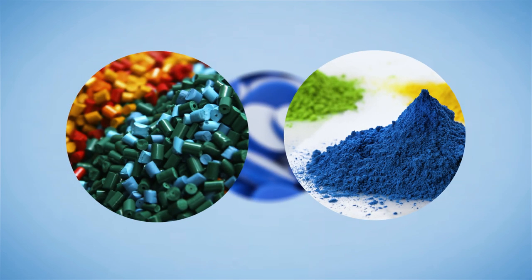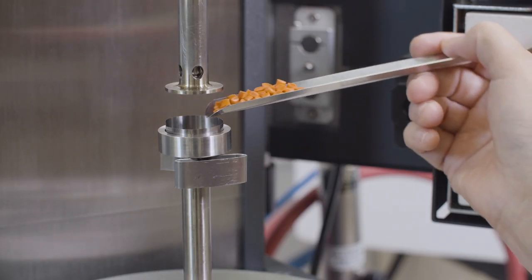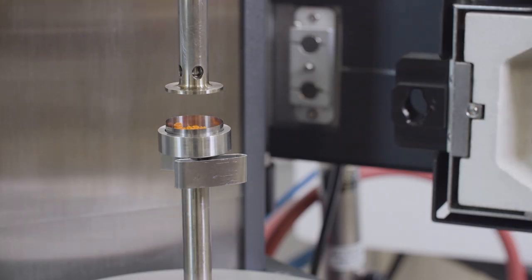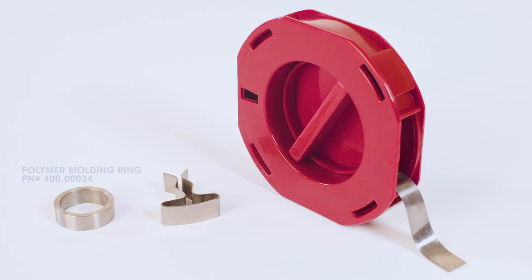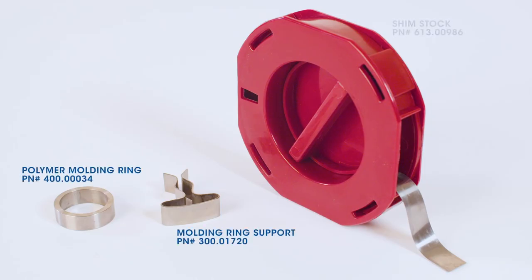Polymers can be in irregular shapes such as powder or pellets. In order to load these kinds of polymers to a parallel plate geometry, we will need to have the following accessories: the polymer molding ring, molding ring support, and shim stock.